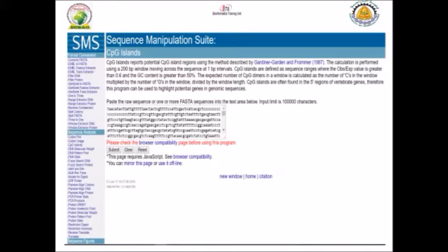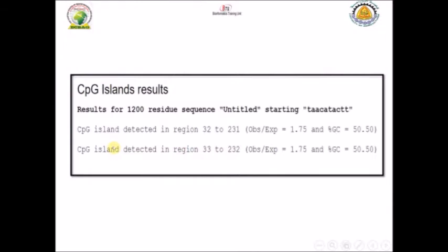The program is very simple — you can just copy and paste your sequence in FASTA format or as a raw format and put it in the submission box. By pressing submit you will get the result immediately. The result will contain the region that contains a CpG island with an observation/expectation value more than 0.6 and GC content more than 50%.